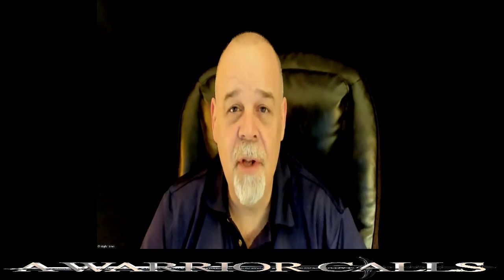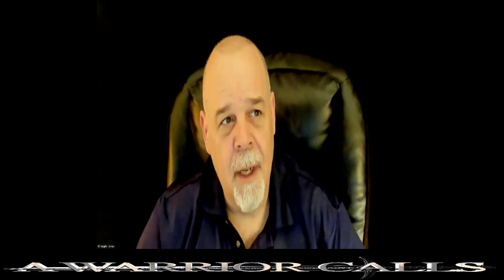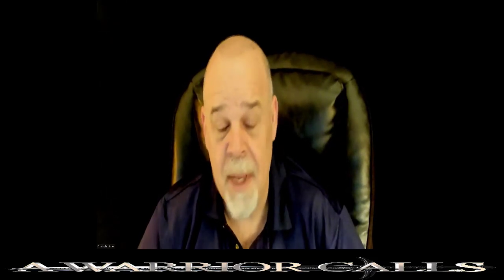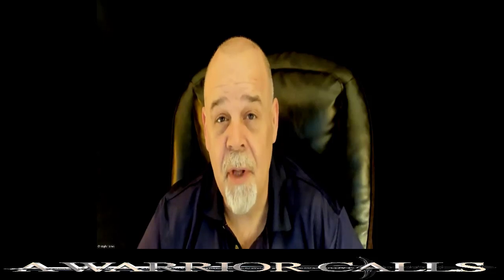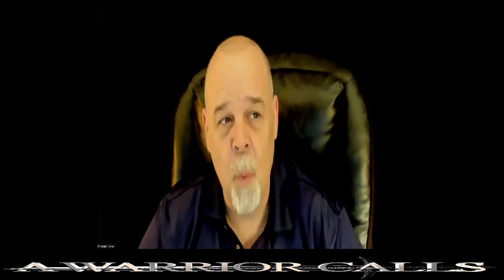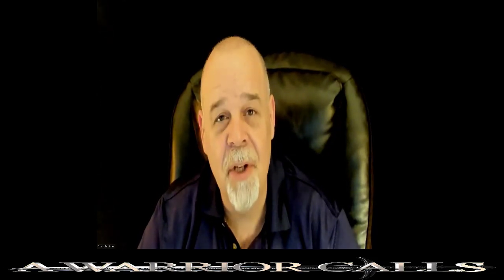What we're going to be discussing here today is, shall we say, the limitations of Darkfield microscopy, because we've had a lot of other people out there that are professionally using this technology that are making some assumptions that are unfortunately not based on the correct technological equipment that they should be using. And this is what we wanted to drill down today to show everyone the separation and the difference at where the limitations are and where the positive sides are.